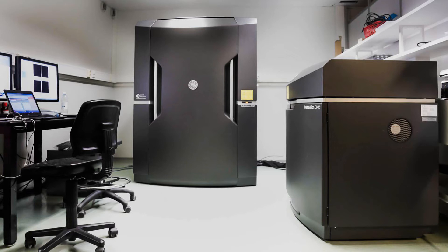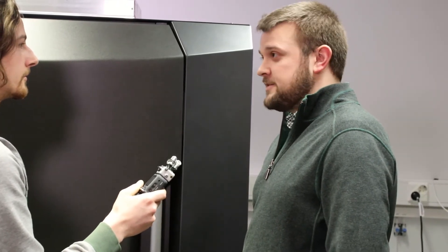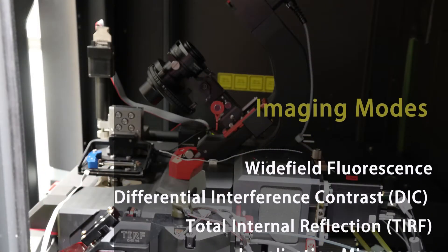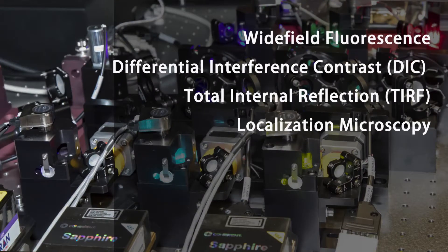So this is our kind of flagship microscope. It's super resolution, super fast. It can do multiple imaging modalities including structured illumination, TIRF, general wide field, deconvolution, and localization techniques. It uses multiple cameras and multiple lasers to go super fast.